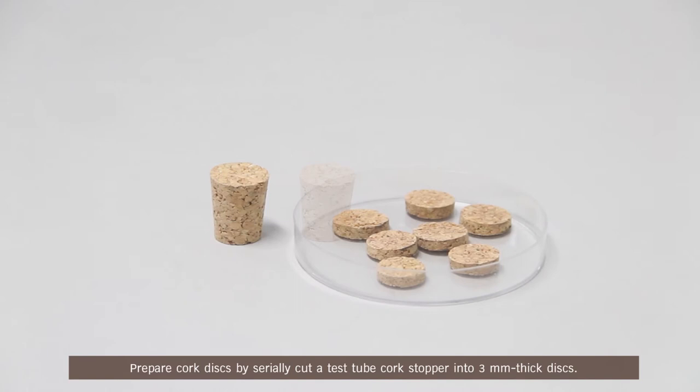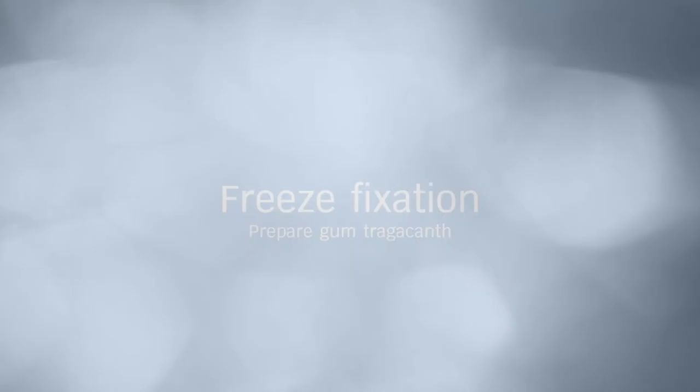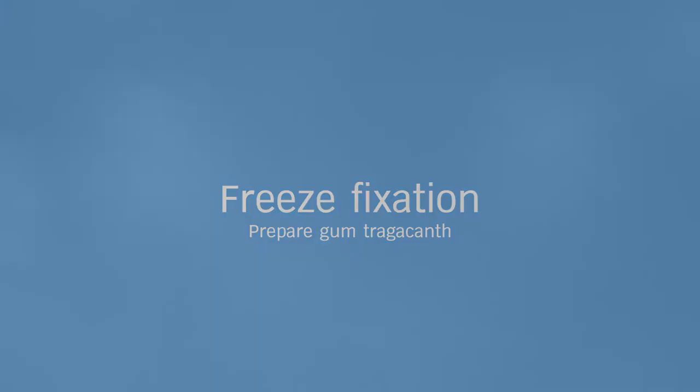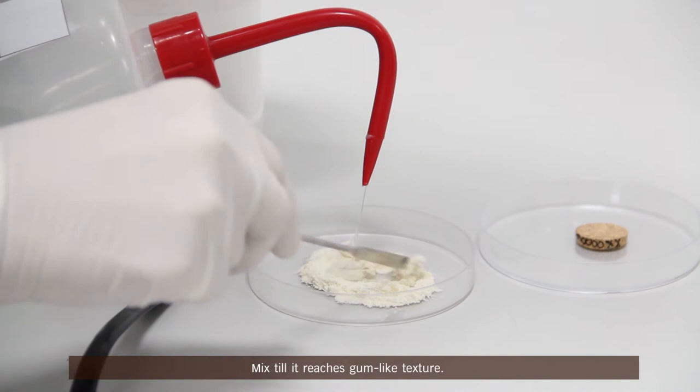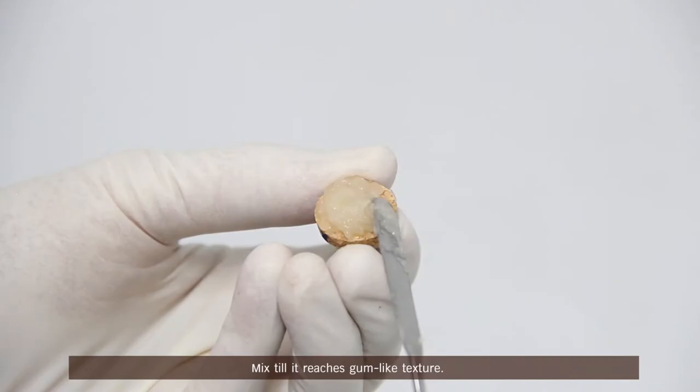Prepare cork discs by serially cutting a test tube cork stopper into 3 mm thick discs. Label each cork disc with patient identifier. Prepare gum tragacanth by adding drops of distilled water into tragacanth powder. Mix till it reaches gum-like texture.